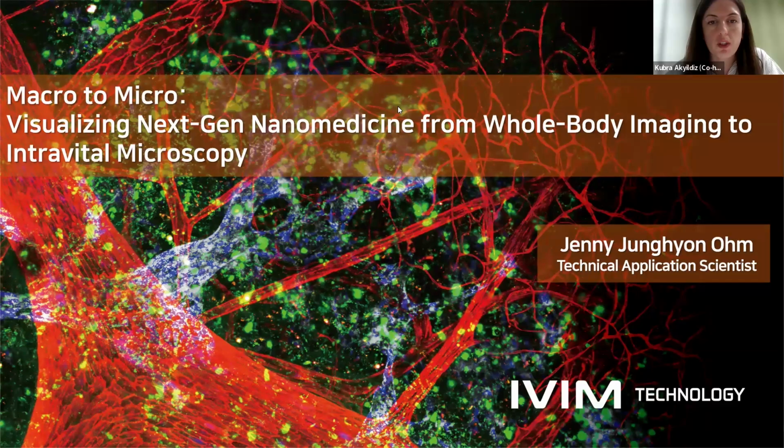In this session, we will be discussing visualizing next generation nanomedicine from whole body imaging to intravital microscopy. We will explore the differences between macro or organ level imaging techniques such as bioluminescence, PET, CT, and MRI, and micro or cellular level imaging, specifically intravital microscopy in our case.